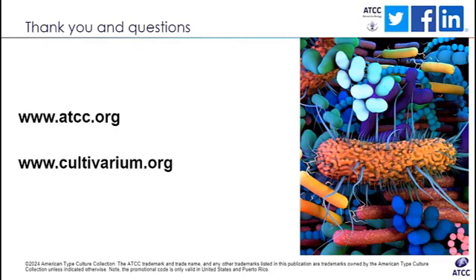Let's see. Here's another one that just came in. Can you work with organisms that can't grow on agar? In parentheses, they put liquid only. Yes, we can definitely work, and we develop our pipelines with organisms that only grow in liquid and not just in agar.